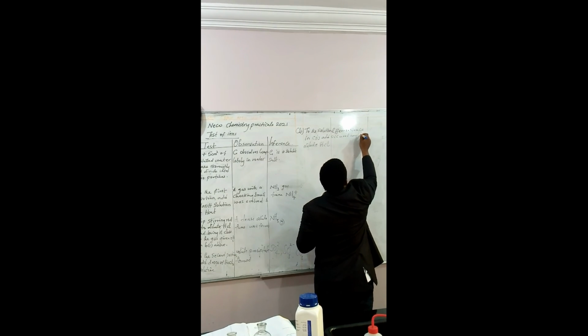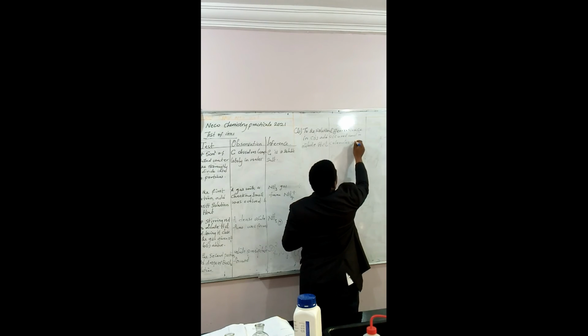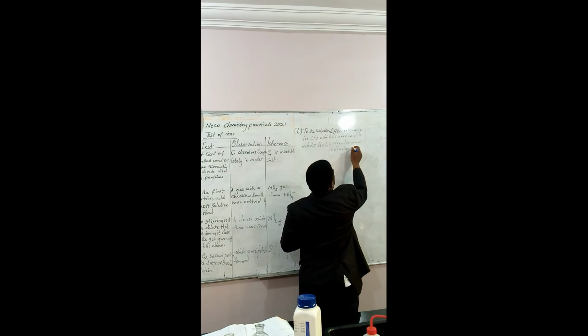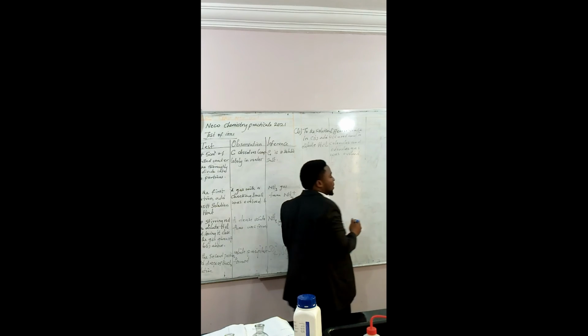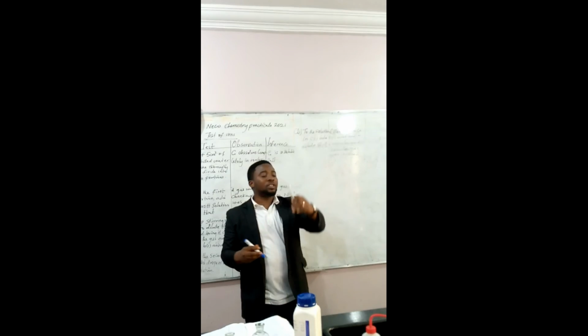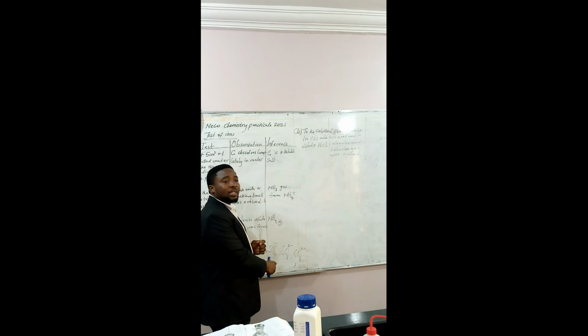So effervescence occurred, and a colorless and odorless gas was evolved. Now that we know that the precipitate is no more, it has dissolved, obviously sulfate ion is absent.